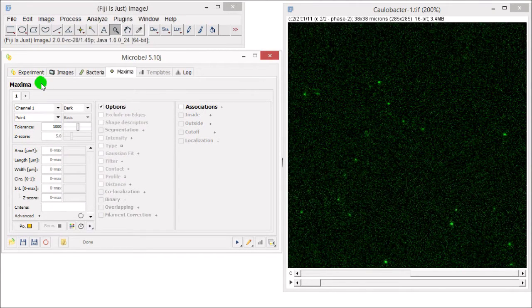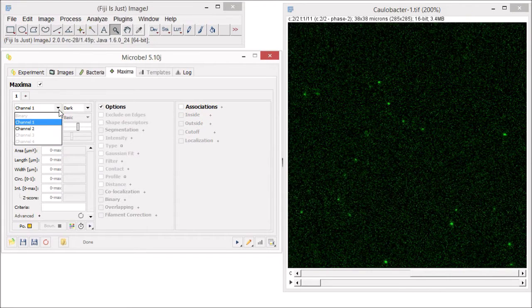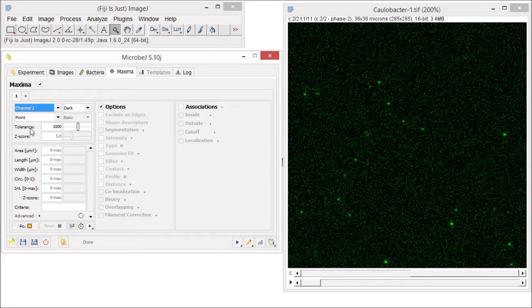To activate the features in the maxima tab, you must first check the box next to maxima. Below this, select the channel that contains the images you will be analyzing for fluorescent particles. In our example, this is channel 2.